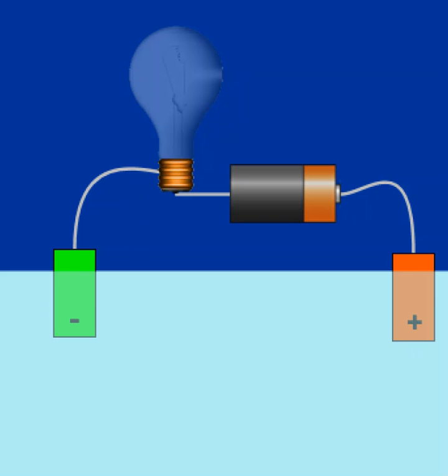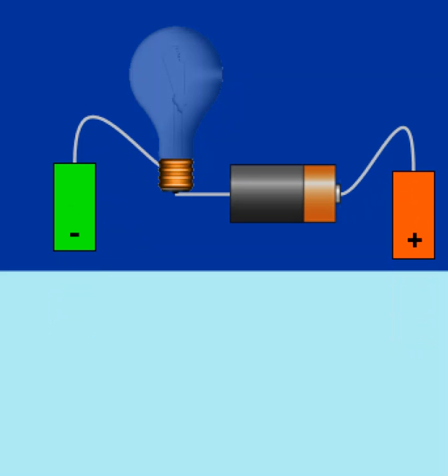Okay. Next, we're going to do hydrochloric acid. And hydrochloric acid, because it's HCl, it looks like it's non-metal, so you would expect it to be molecular. But acids that start with H, like that formula, they act ionic when you put them in water. So let me get my hydrochloric acid.